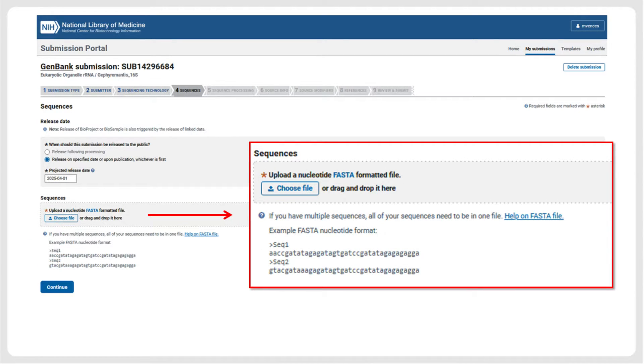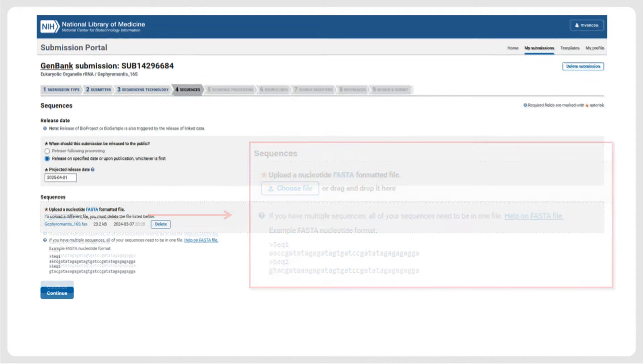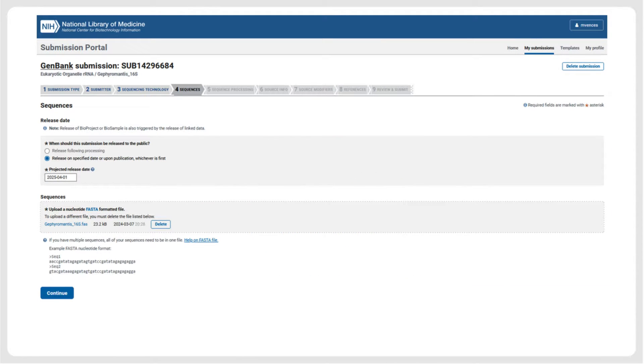In the next step, the FASTA file containing the sequences and the source modifier information is uploaded. On the same page, the release date of the sequence records also needs to be specified. Because our submission contains unpublished scientific names of new species, we specify a later release date here to ensure that the records with the new names will not be released before publication of the respective paper.